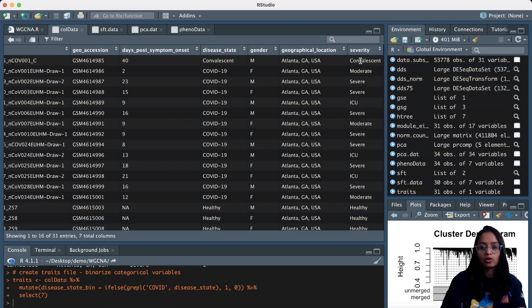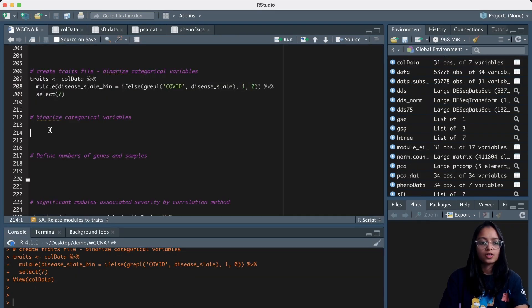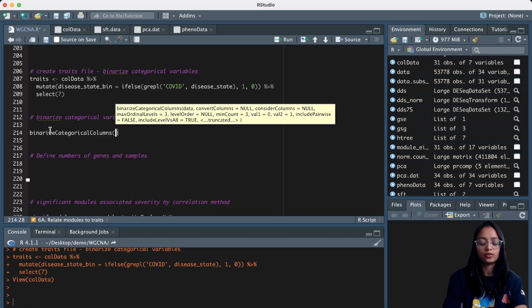We can create one column for each of these levels. For example, we can create a column for convalescent and assign it a value of one for convalescent samples and zero for the rest. Similarly, we can create another column for moderate, assigning one for moderate COVID-19 cases and zero for the rest, and so on. We do this using a function called binarize_categorical_columns.